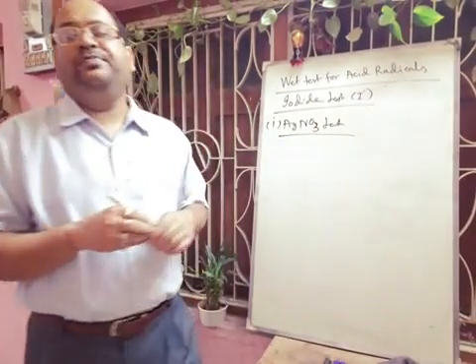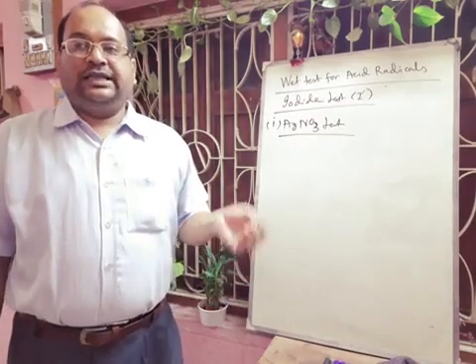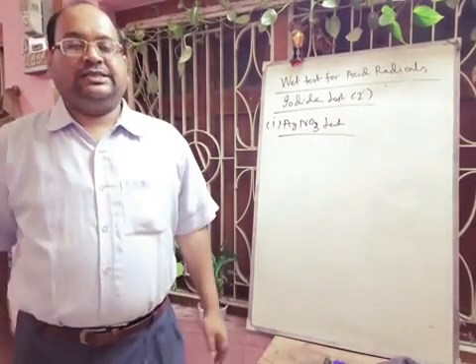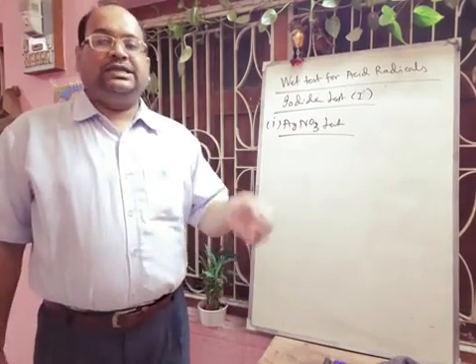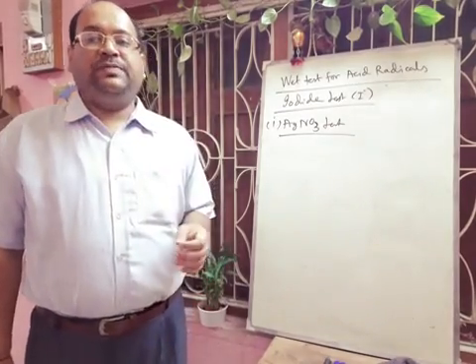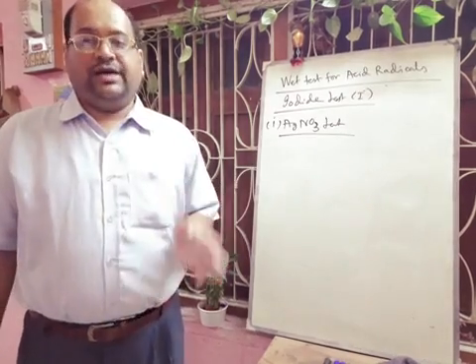In the same way, we take 2 ml of the sodium extract and add dilute nitric acid to boil off the carbon dioxide. Then we apply heat, cool, and add silver nitrate solution. Here we will get a yellow precipitate of silver iodide, and this precipitate is insoluble in ammonium hydroxide. In this way also we can confirm I⁻.